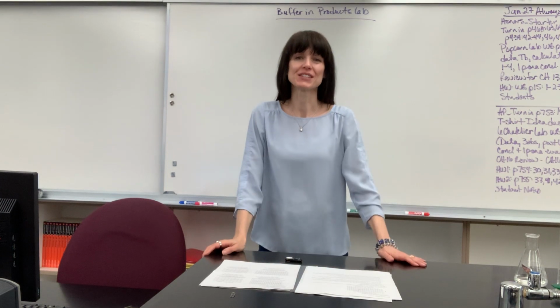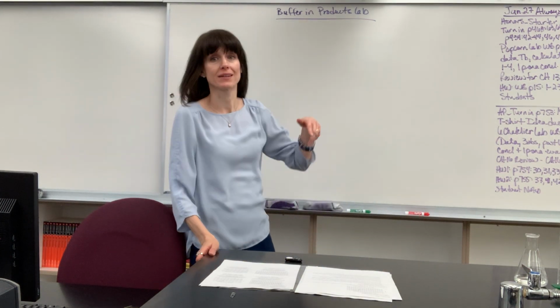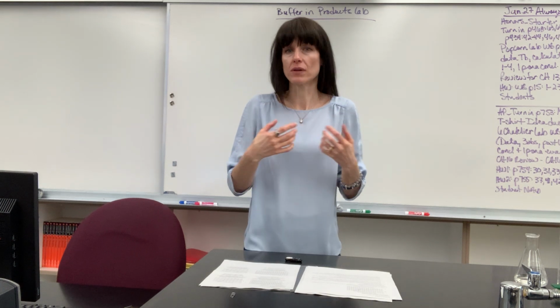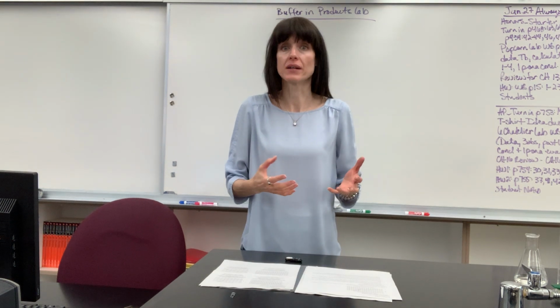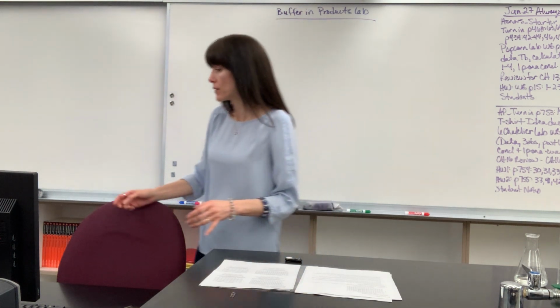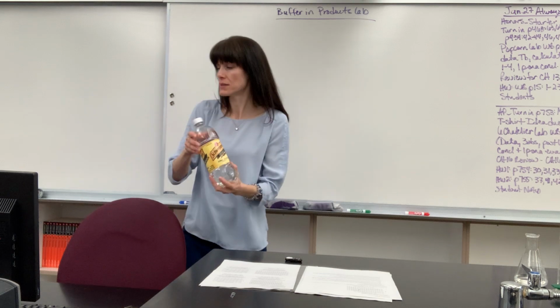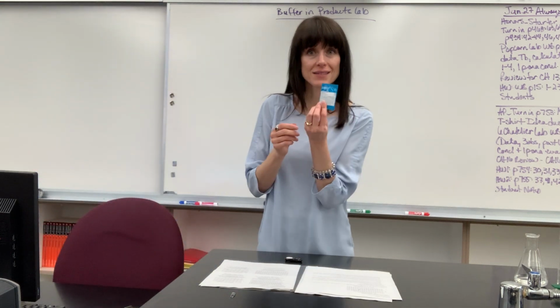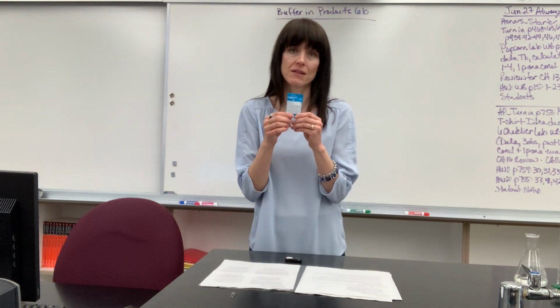Hi, I want to talk to you about a buffer and products lab. Here's the driving question: What is the buffering capacity of different products that you and I consume? We are going to look at, say, the buffering capacity of, actually we'll do this example, Alka-Seltzer. Okay, what's the buffering capacity of this?